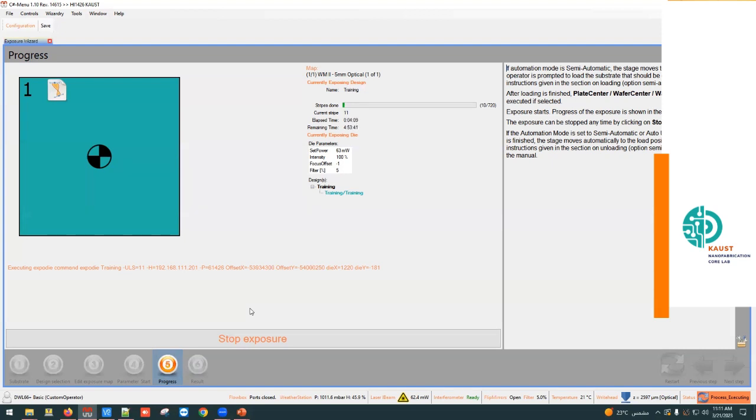Before, we bought plenty of blank masks. Can we use these blank masks to get a 300 nanometer resolution? No. May I ask why you want to have 300 nanometers on a mask?